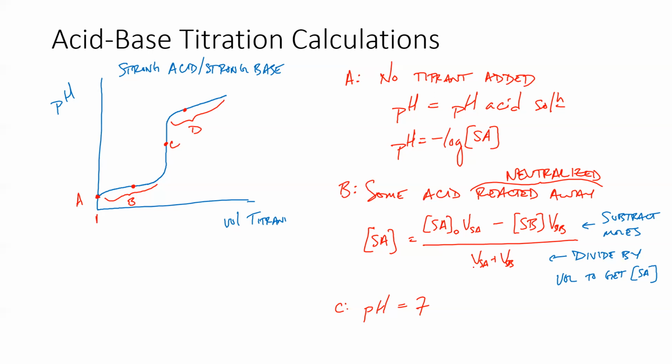And so we're not going to introduce a whole lot of error because of the size of that difference. Now, if the pH change happened at a pH of 9 or something, we'd have to add several more drops to go from pH of 7 to pH of 9, and we would introduce a lot more error that way.